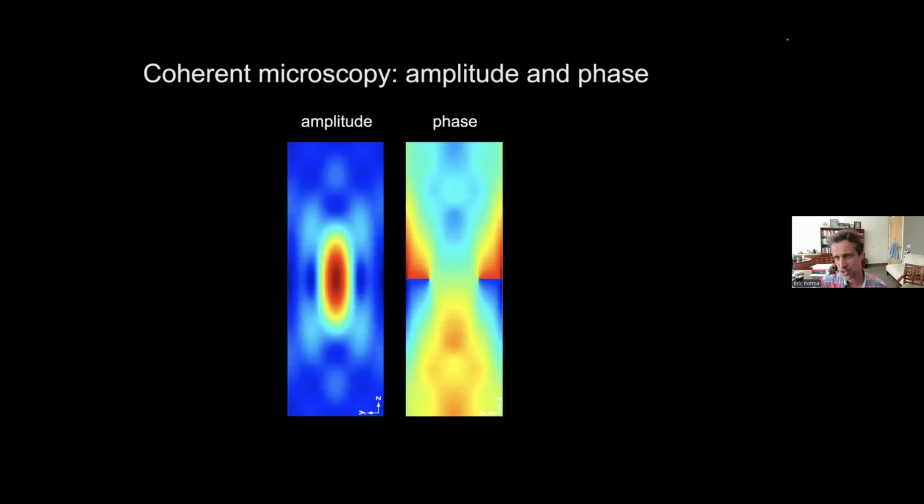I showed you this image in the beginning, and I said it's going to be important later on. Now we are later on, and so let's talk about it, because there's a phasing effect, and I just told you that this CARS process and all coherent processes depend on the phasing of these molecular oscillators. The way they shake and their position in focus is determining how the photon that they produce will come out and interfere with the photons produced by other molecules.